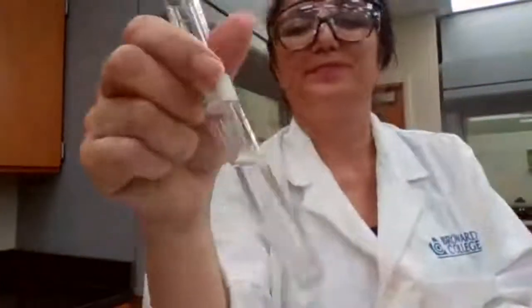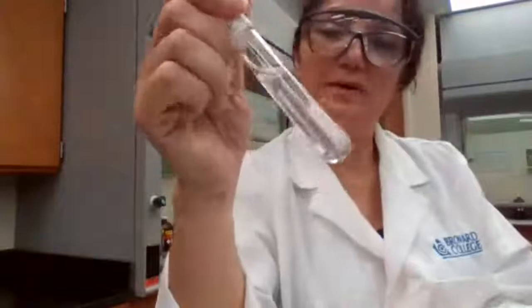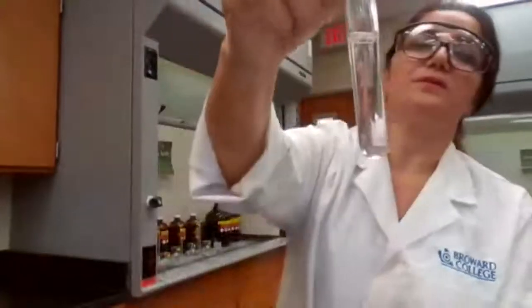Record your observation. Just the clear water, with the test tube that is not so clear.